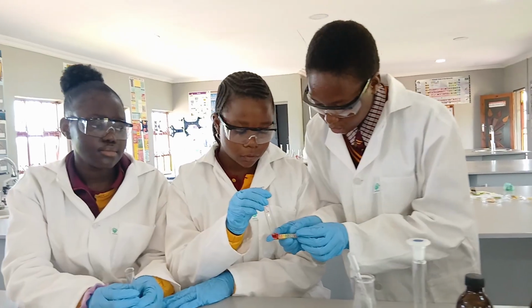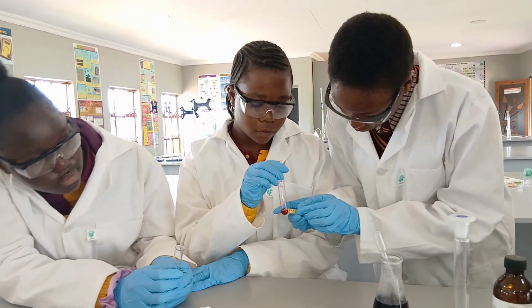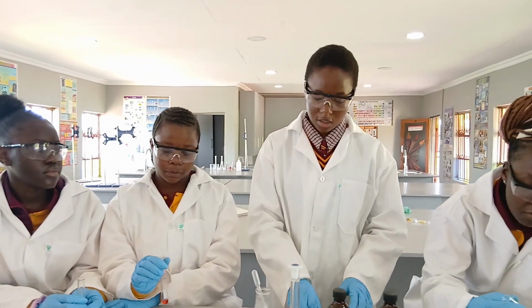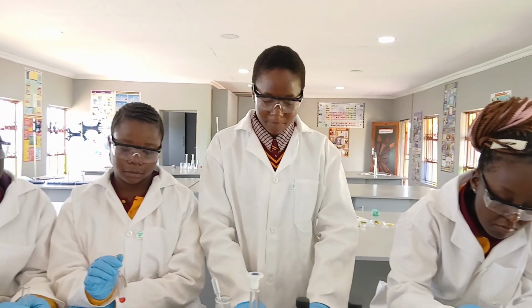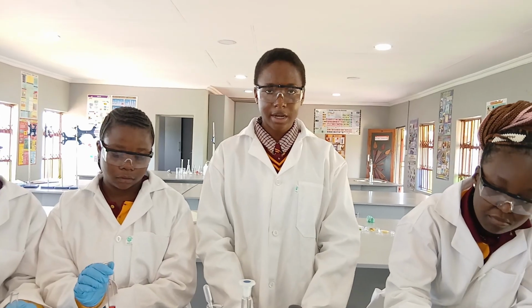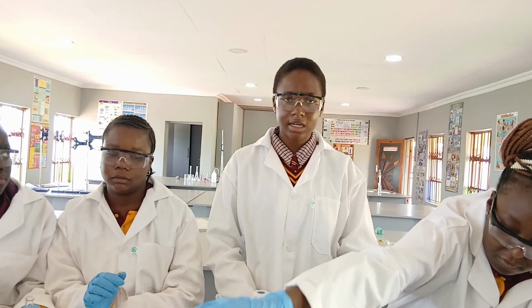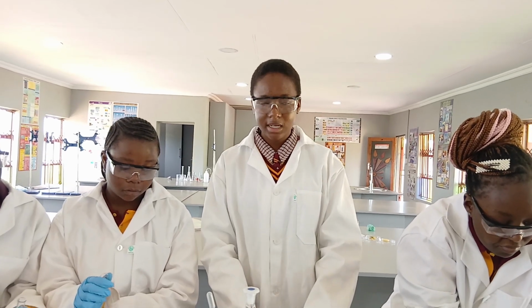So in response to the color change, it falls between 1 and 3, meaning it's an acid. Because we should take note that if our pH is from 6.9 going down, which means decreasing, it means that it's an acid. If it's 7, it's neutral, and if it's from 7.1 going upwards or to the right, it's a base.